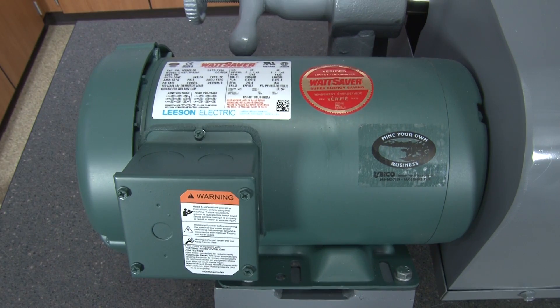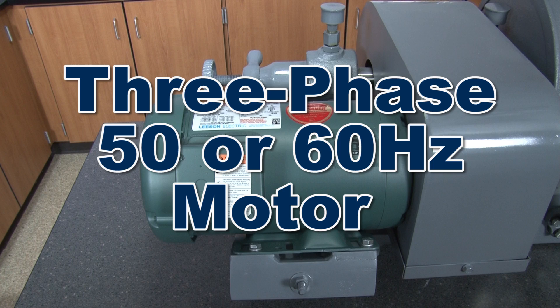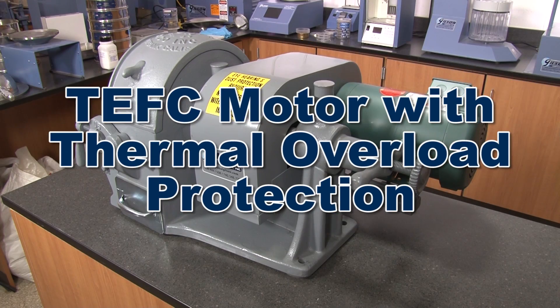Powered from a 2-horsepower motor that rotates the shaft at 900 to 1000 RPM through the enclosed double V-belt drive, this three-phase 50 or 60 Hertz motor can be set to operate on either 220 or 440 volts, and the TEFC-type motor has thermal overload protection for a long service life.